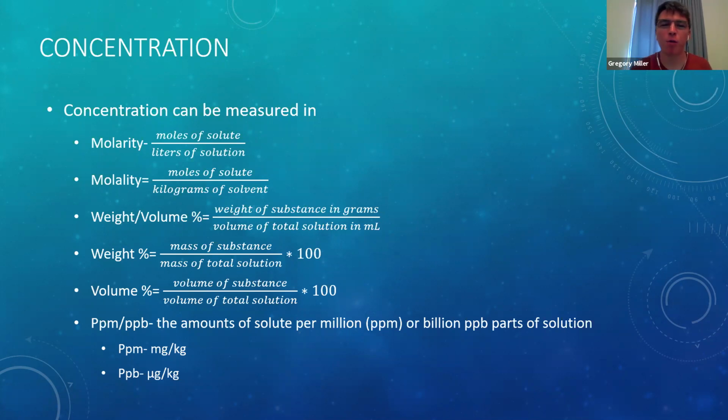This is primarily used for liquid-liquid mixtures. If you're combining two liquids together to make a solution, because it's easier to measure out the volume of a liquid than it is the volume of a solid.